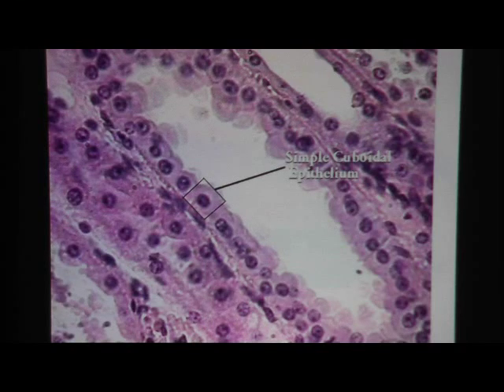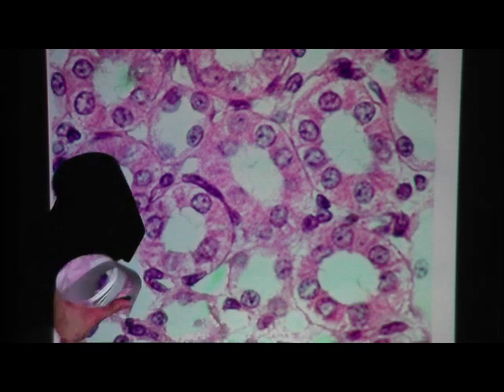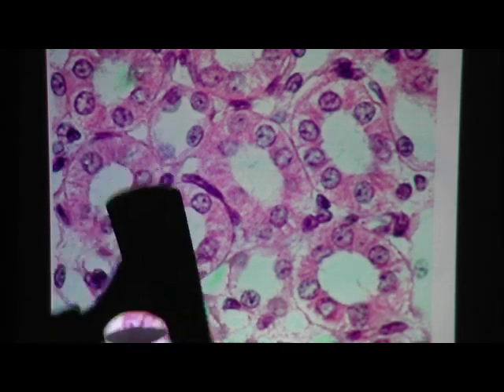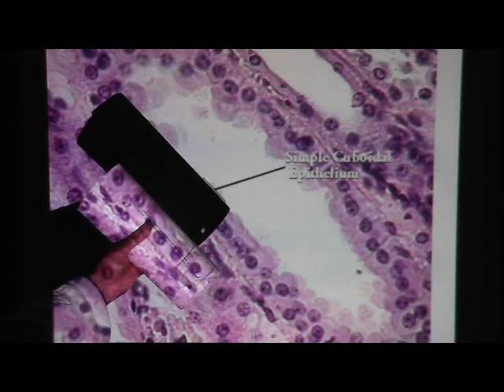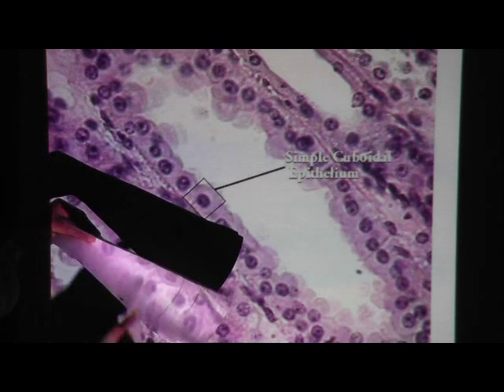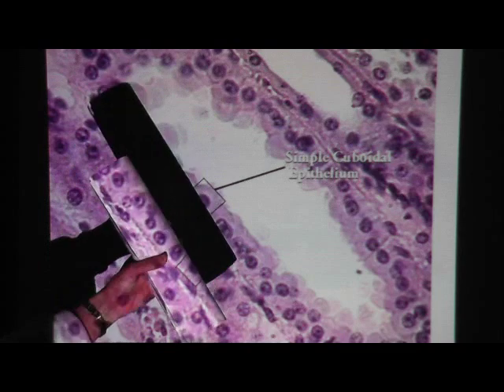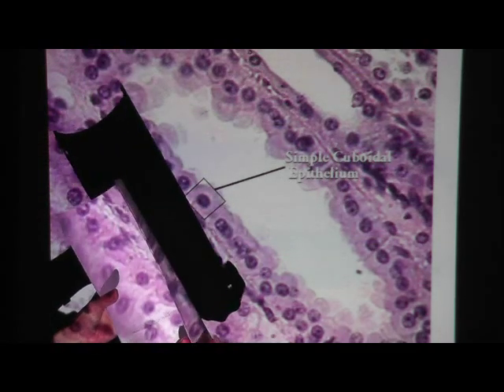Here's the side view. Previously all the tubules were coming toward you into the board; now the tubules are going sideways. We cut the tubule so you're looking at the cut surface running across the board. The white space still tells you this is epithelial tissue.